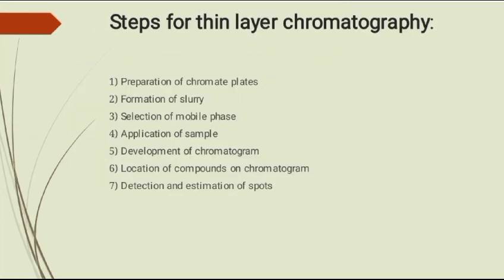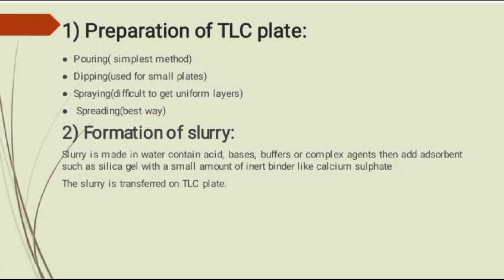Steps for thin layer chromatography. These are the 7 steps involved in the whole process of thin layer chromatography. First step is preparation of TLC plates and the second step is formation of slurry.